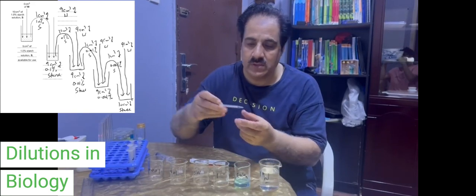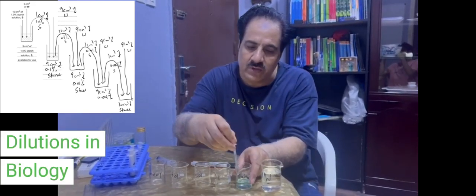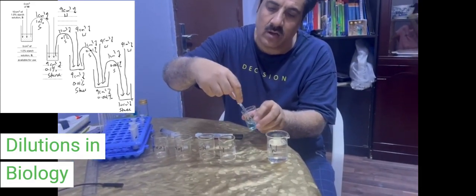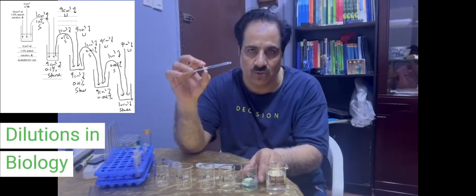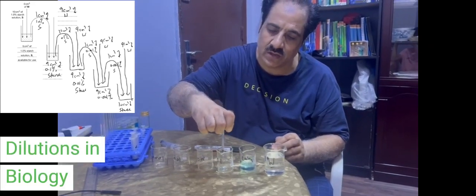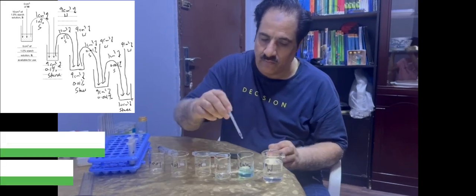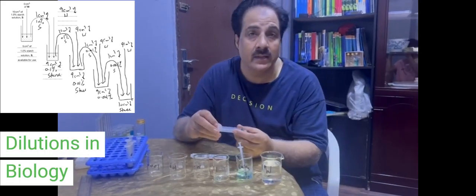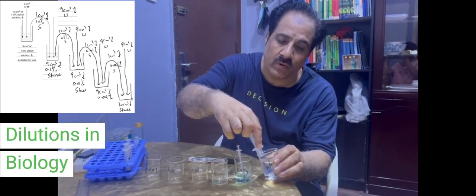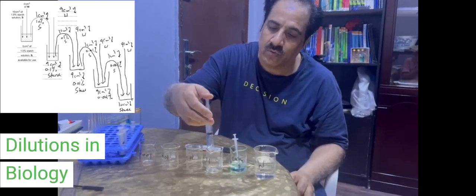So this is a syringe which has the capacity of 1 centimeter cube. We'll use the 1 centimeter cube syringe and take out 1 centimeter cube from the stock solution and put it in the first beaker, where we have to reduce its concentration by a factor of 10. Then we'll use another syringe to take out 9 centimeter cube of water, and we'll add it to this beaker.